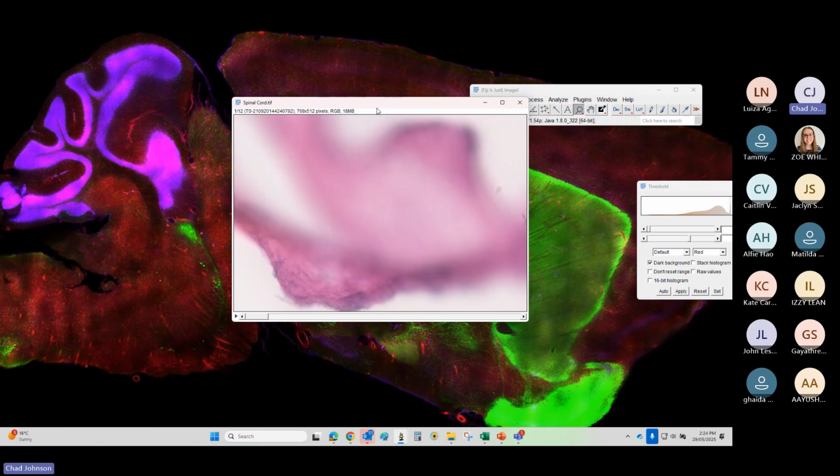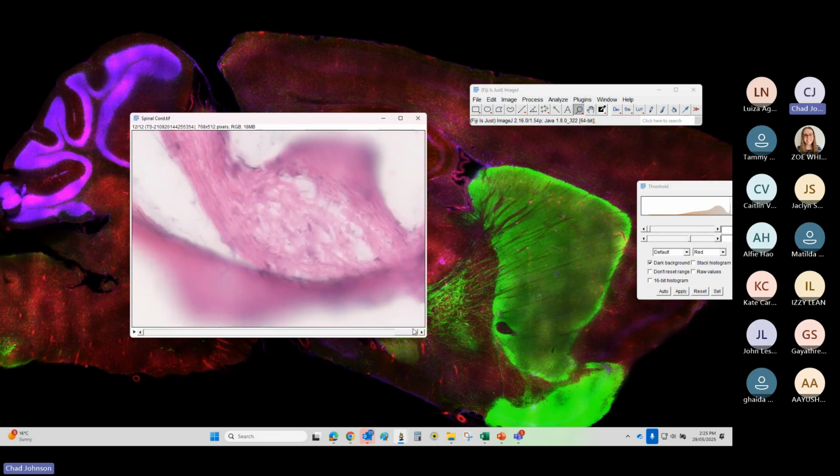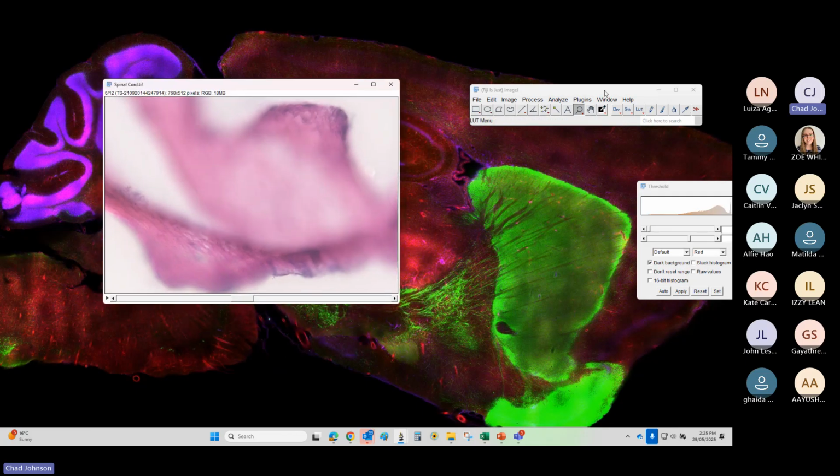Now, this is an image stack that I took upstairs on one of our basic wide field, bright field images. This is a stack of a somewhat thick piece of spinal cord. As we go through the different focal planes, we can see that part of the image is in focus, but part of the image is blurry and out of focus. So as we move through, we see more of the in focus parts. Now this is not much help to us if we want to look at it as a single image. So we're going to have to make some changes with our extended depth of field.